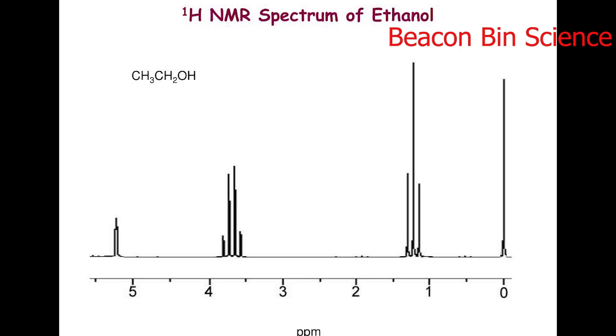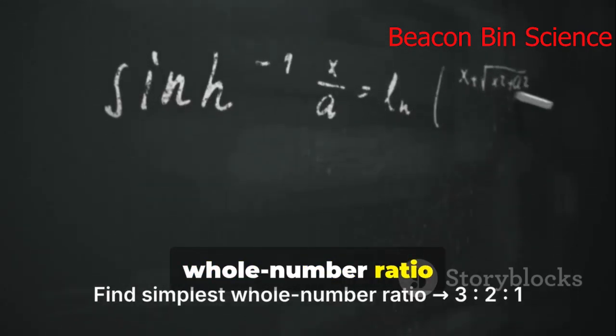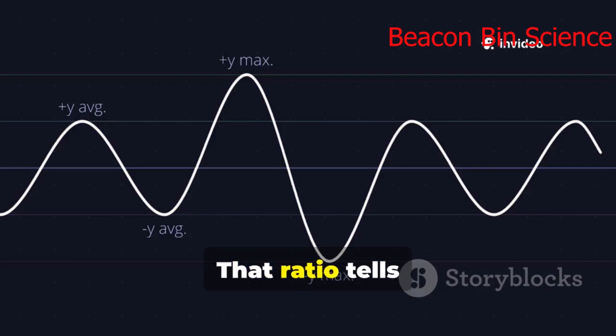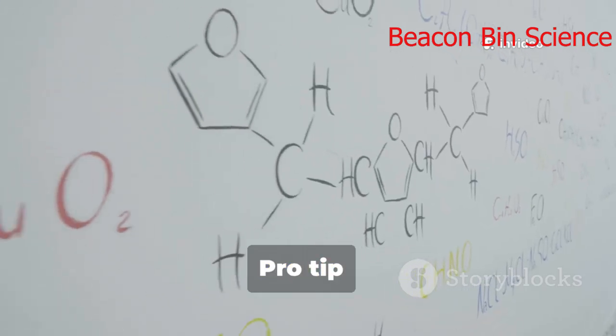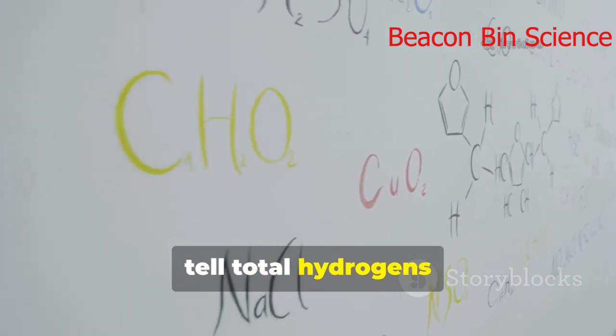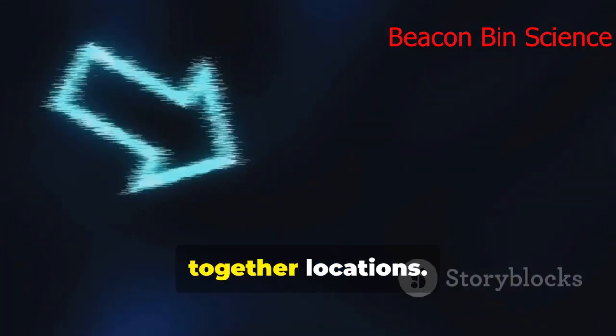Integrations don't always give whole numbers. Sometimes you'll see weird fractions or decimals. Don't panic. Find the simplest whole number ratio between the signals. That ratio tells you how many hydrogens each set represents. Pro tip: integrations don't tell total hydrogens without the formula. They do tell relative numbers, so you can piece together locations.